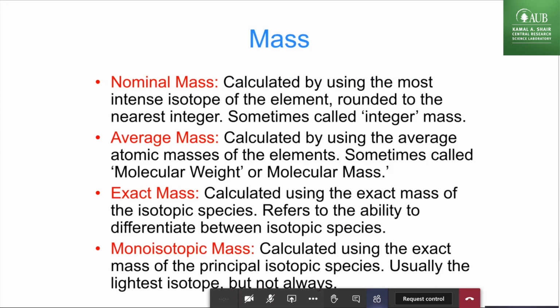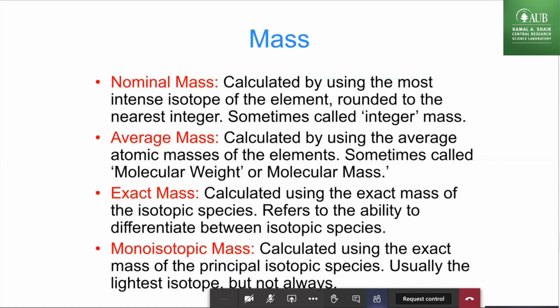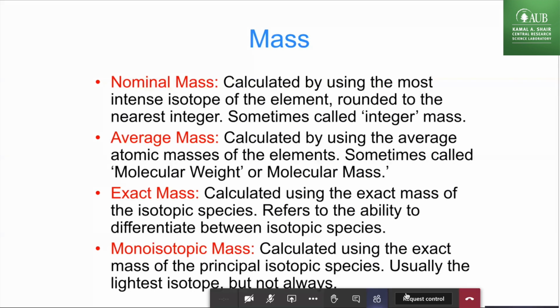What do you normally do? Let's say you have a powder and you buy ammonium acetate or you buy ammonium formate, right? Probably you used ammonium formate to prepare your solvents. And it says on the package molecular weight. What did you do with that powder? How did you prepare it? What do you do when you buy a powder? You make a solution, right? How do you make a solution?